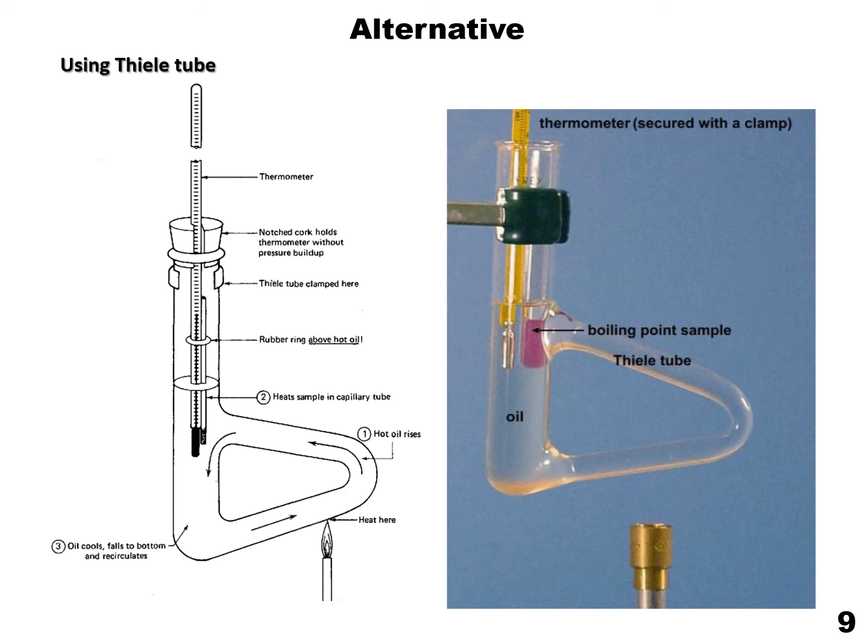So again, we use oil because oil has a greater boiling point than some of the solids, and the remaining operation is similar to the one using a test tube.